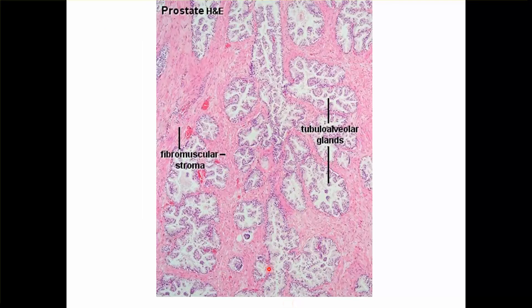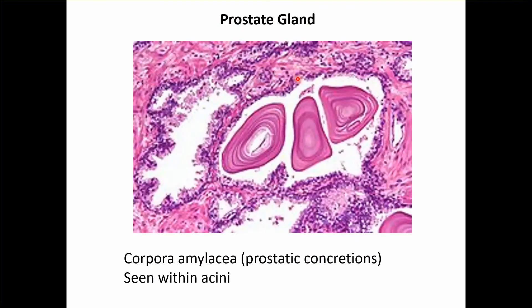You have the fibromuscular stroma separating the glands. These are the tubular alveolar glands which give alkaline secretion — a normal prostate showing a flowery kind of pattern. If you see concretions within, they are called corpora amylacia — prostatic concretions seen within the acini.